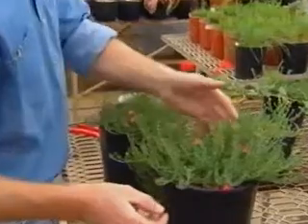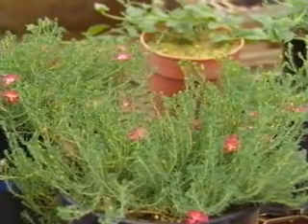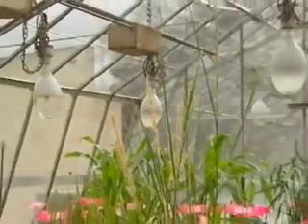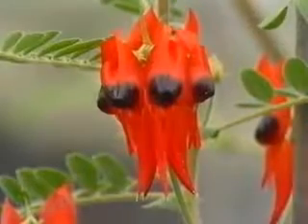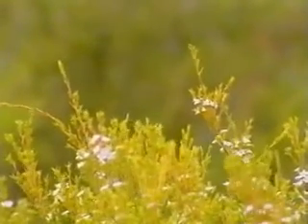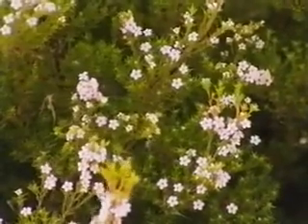In general, stock plants should be healthy and actively growing, not in or entering dormancy. Pruning or use of supplementary light for increasing day length is sometimes useful in maintaining active growth. Ideally, stock plants should be grown in a glasshouse. Field-grown materials are often very difficult to disinfest and establish clean cultures in vitro.